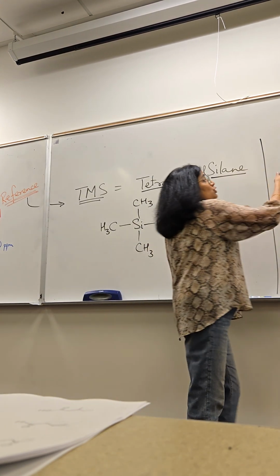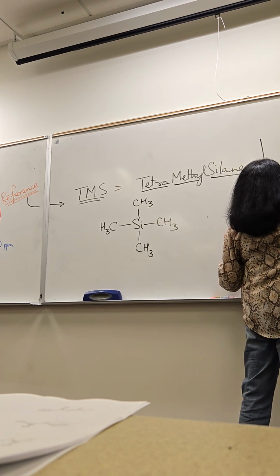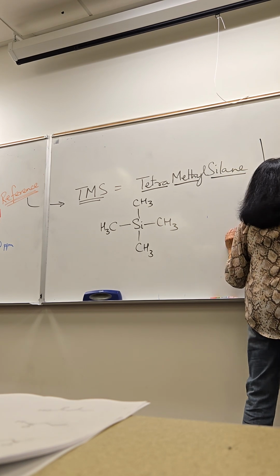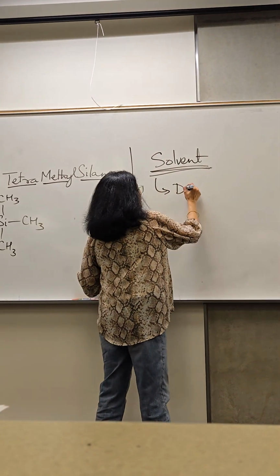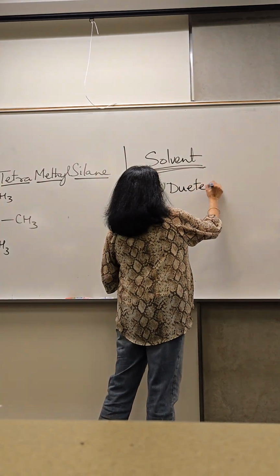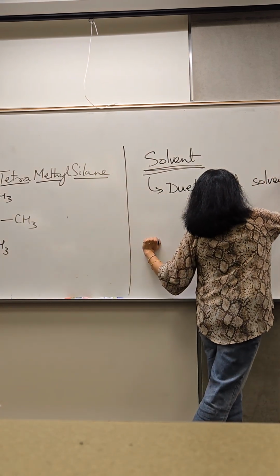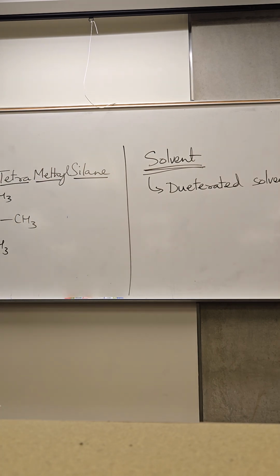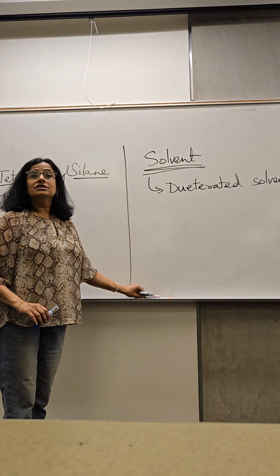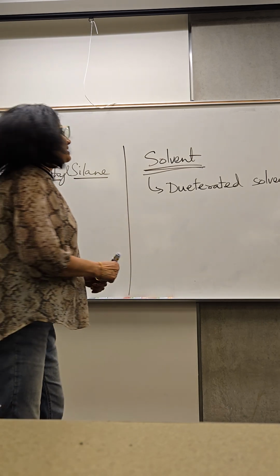But if you need to dissolve your compound in a solvent so we can create a homogeneous solution, then we have to use a deuterated solvent.